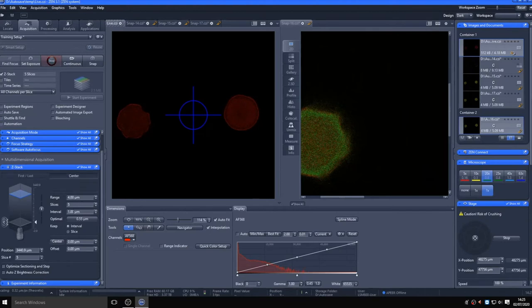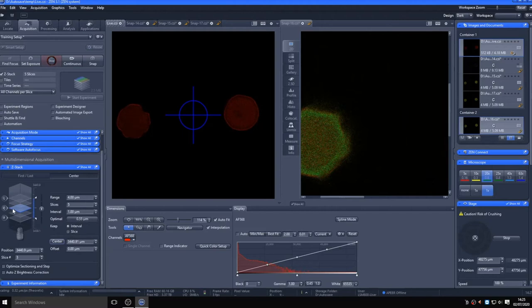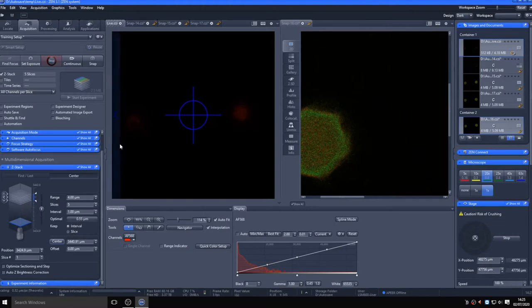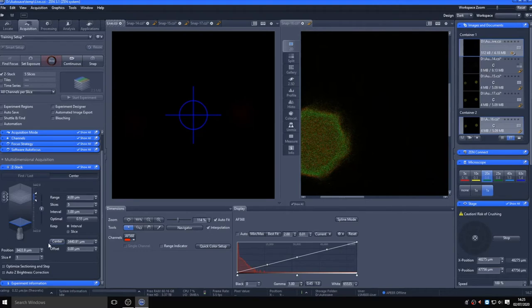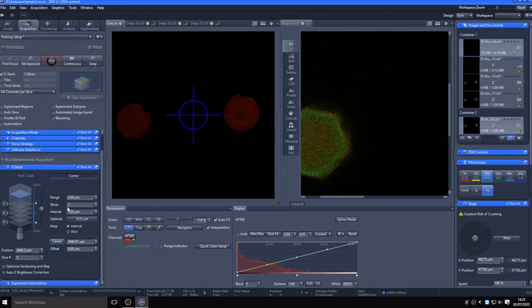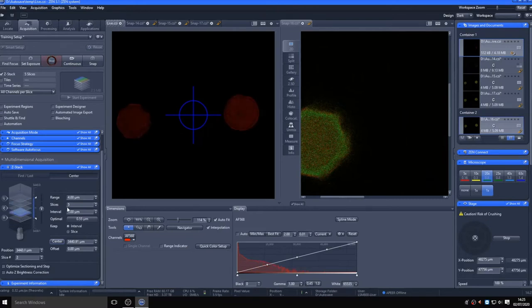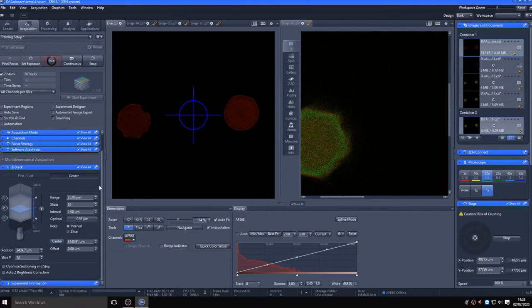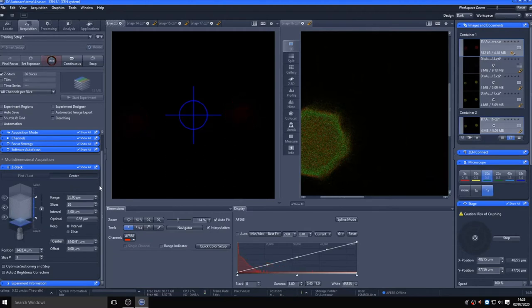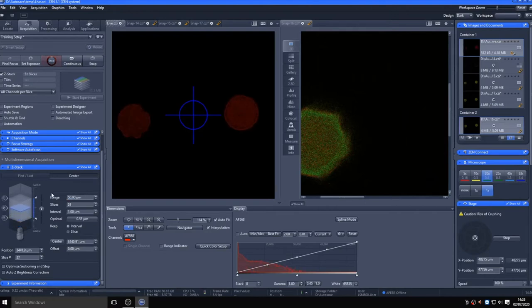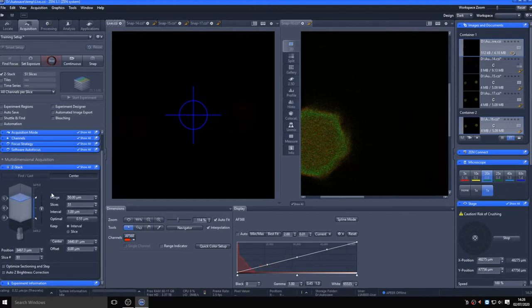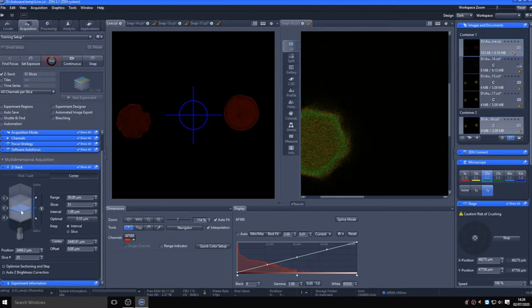Currently it is set at 4 microns. We can see on the position indicator that our sample here is too large if we focus through our sample. Increasing the depth to 25 microns is still not large enough if we scroll to the bottom. 50 micrometers, however, does capture the entire sample. Once you have set the range, you can alter the sectioning frequency. So changing the interval from 1 to 2 microns will halve the number of slices taken across the 50-micron range.